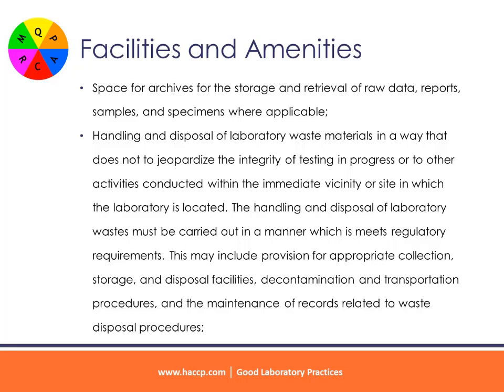Handling and disposal of laboratory waste materials in a way that does not jeopardize the integrity of testing in progress or other activities conducted within the immediate vicinity or sites in which the laboratory is located. The handling and disposal of laboratory wastes must be carried out in a manner which meets regulatory requirements. This may include provision for appropriate collection, storage, and disposal facilities, decontamination and transportation procedures, and the maintenance of records related to waste disposal procedures.